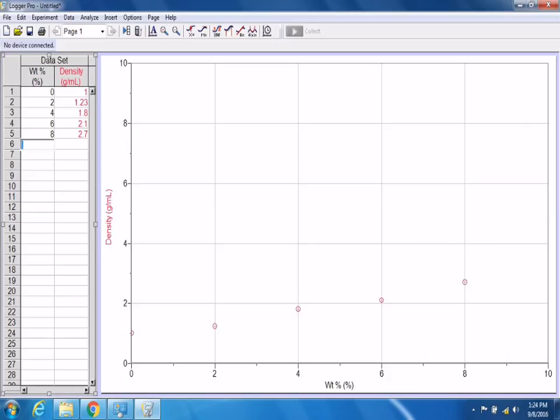Okay, so you kind of see hopefully the dots along the bottom. Not bad. I'm not real thrilled with the auto scaling, because they always tell you when you do your dots, it should use up about 2/3 of your graph, something like that. So I can fix that. Let me show you how I fix that. I'm going to do a right click on my graph.